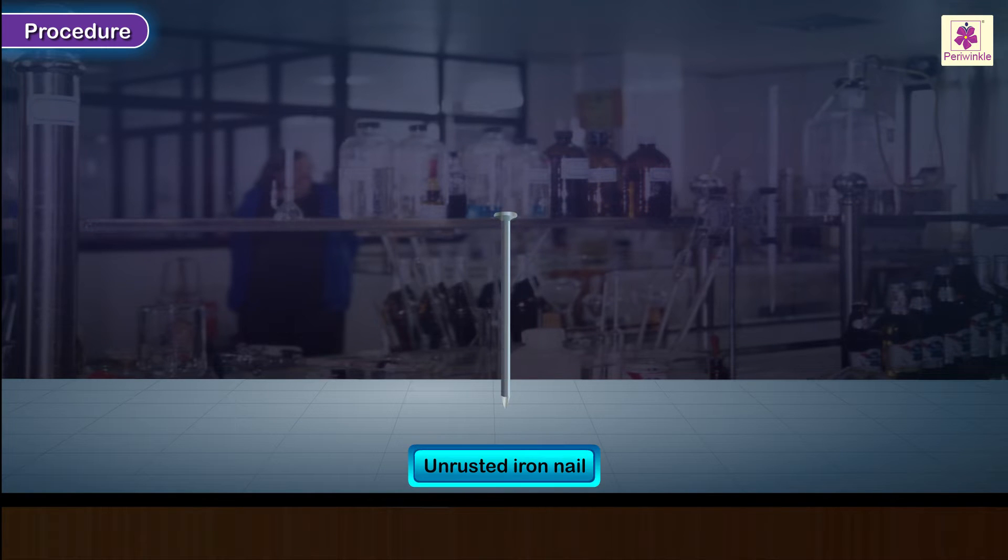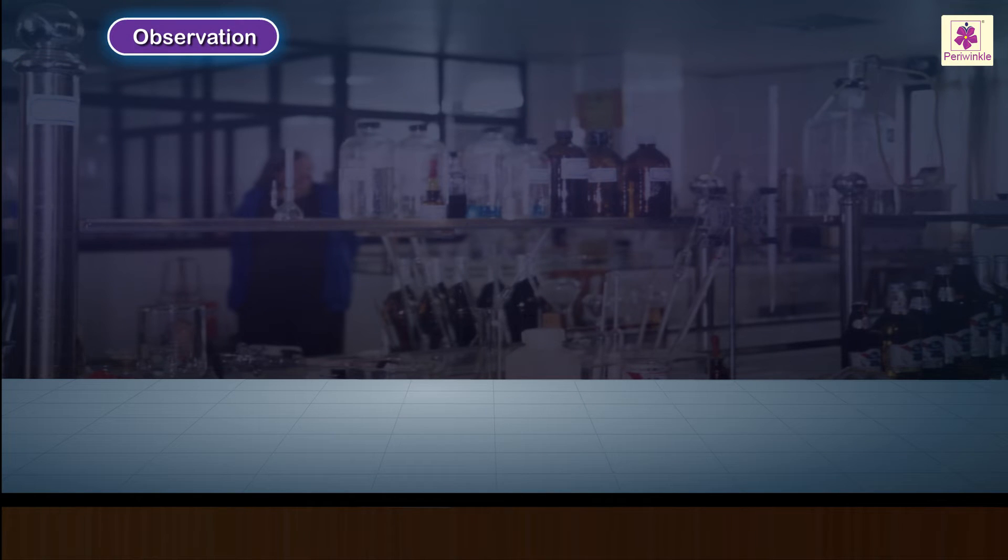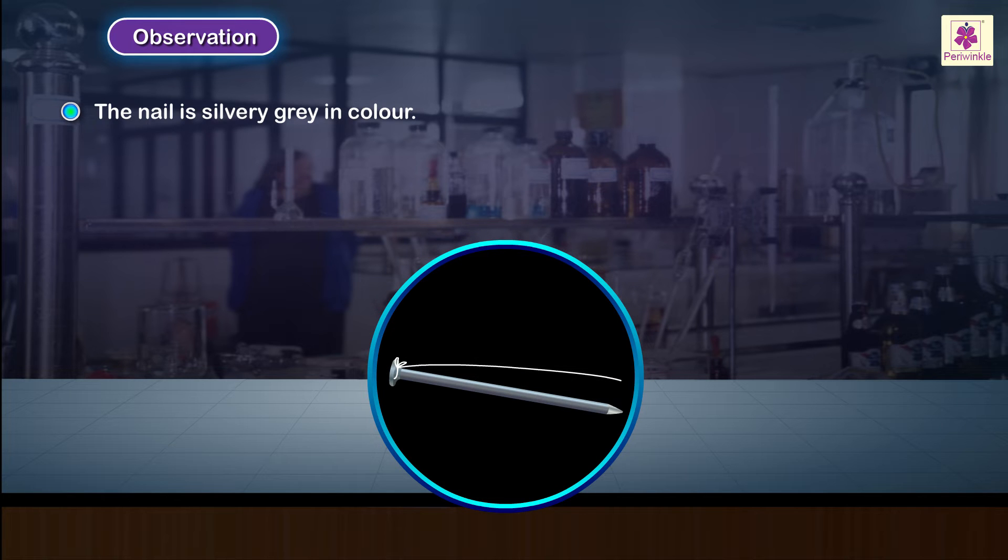Take an unrusted iron nail. Tie a piece of white sewing thread to the nail and keep it on the table. Observation: the nail is silvery grey in colour.